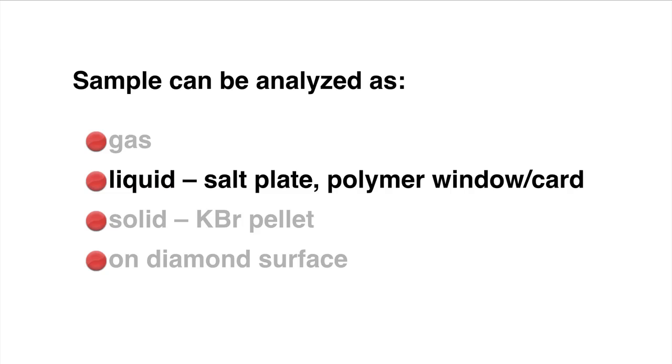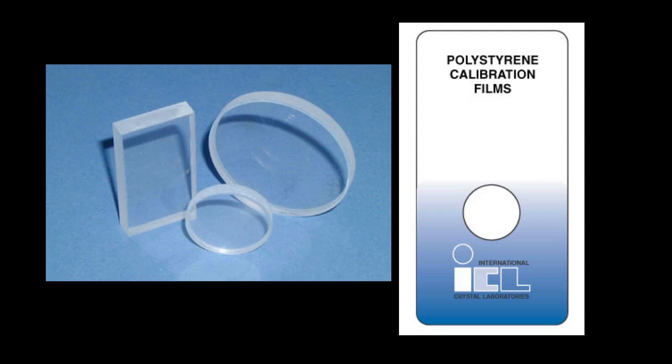One is using what is called a salt plate and one is using what I'll call a polymer window card. Now the salt plate is exactly what it says it is. It is a salt plate. What you're seeing here on the screen on the left are single crystals of sodium chloride. What you do is place a drop of a liquid onto one of these salt plates, then you'll get another one the same size and you put them together like making a cookie sandwich, and you just make a thin film with your sample.